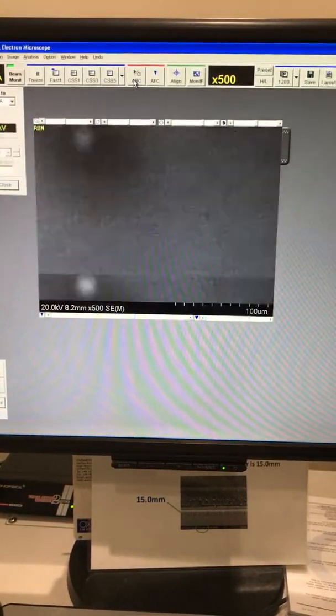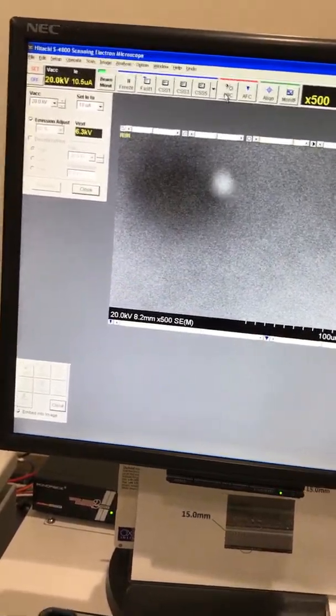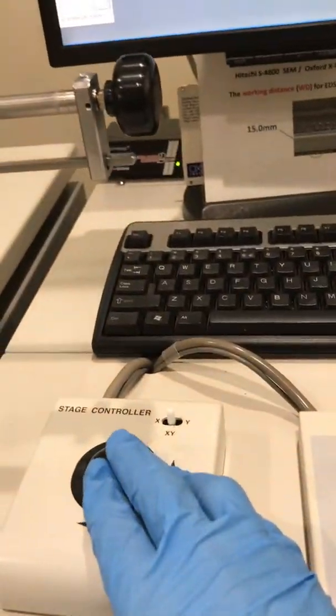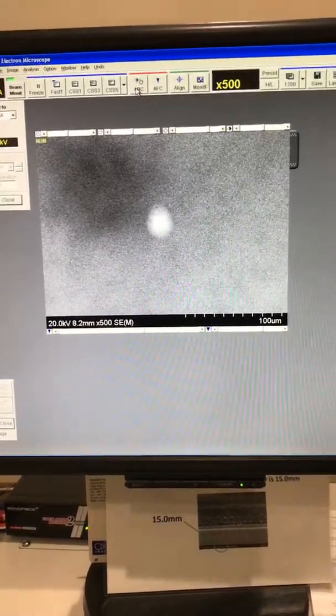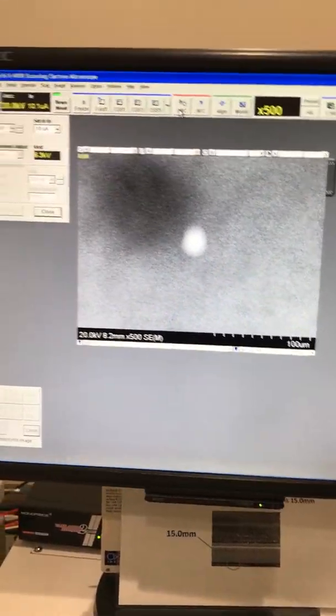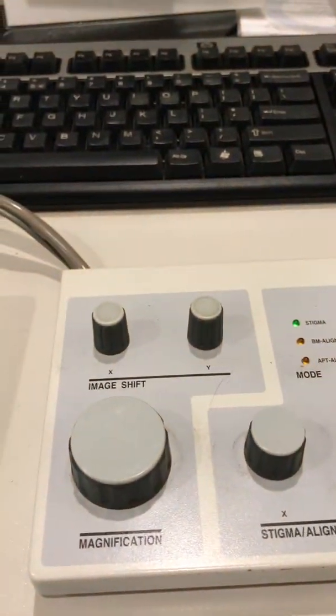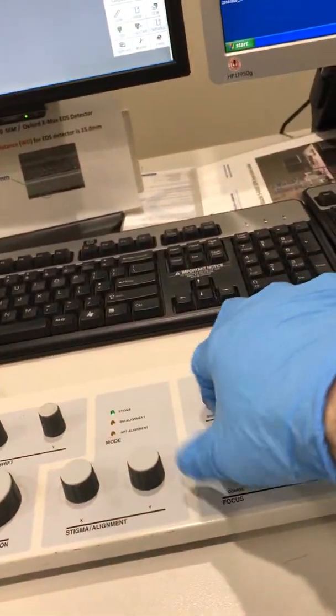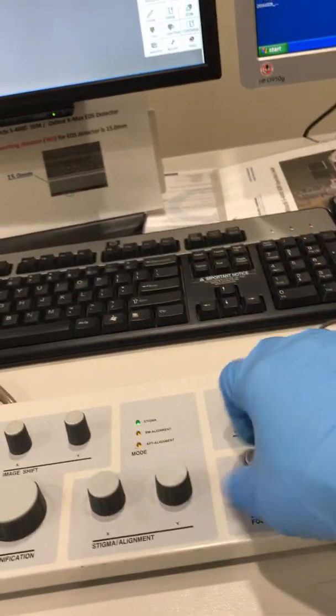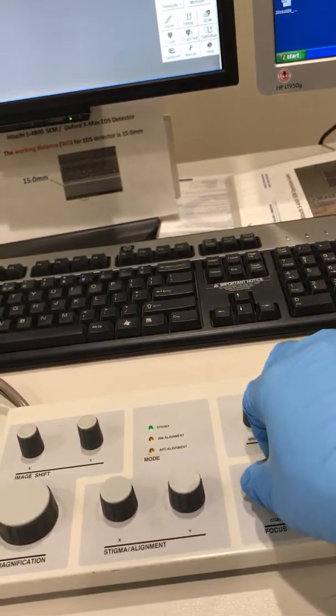Now bring that contamination or dust into the middle of the screen by navigating. Then, using your focus knobs, try to focus on your sample. I'm turning this, just focusing on the sample.